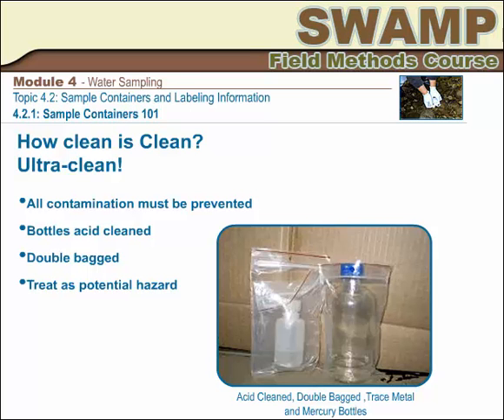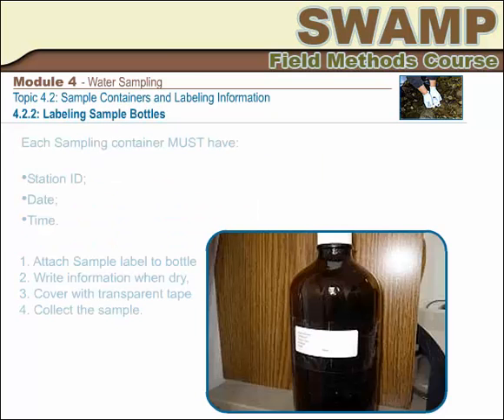You probably know already that a full sample container without a label is a liability and is even worse than a useless sample. You might also know that it is impossible to write on a wet surface, that nobody can read what is written on a dark bottle, and that permanent ink is not always that permanent. So it will make sense to you to make sure that you attach the appropriate type of sample label, with water-insoluble adhesive, to each bottle.